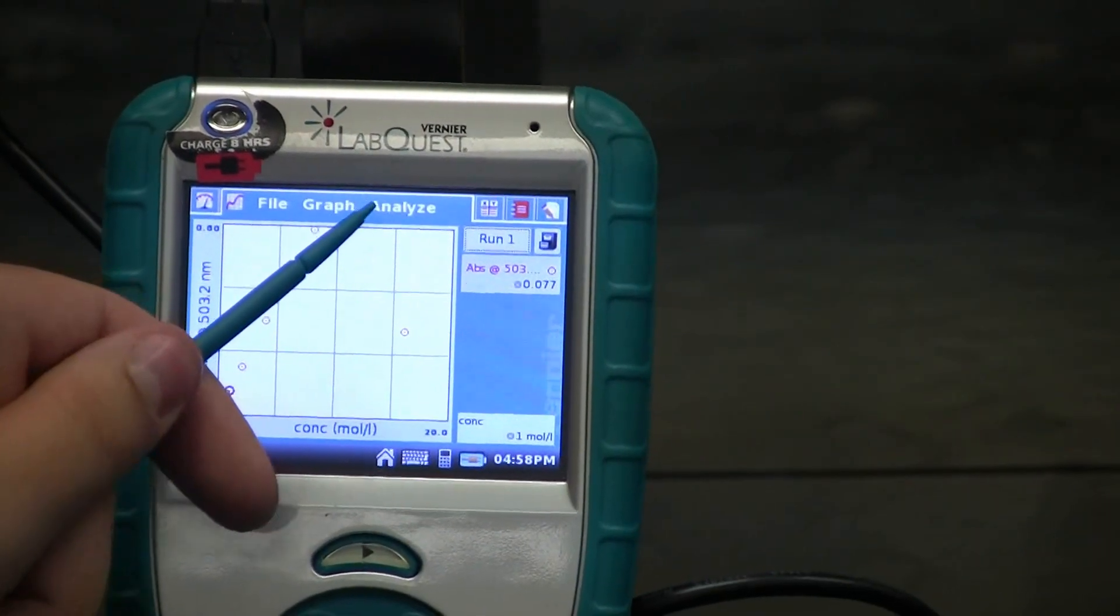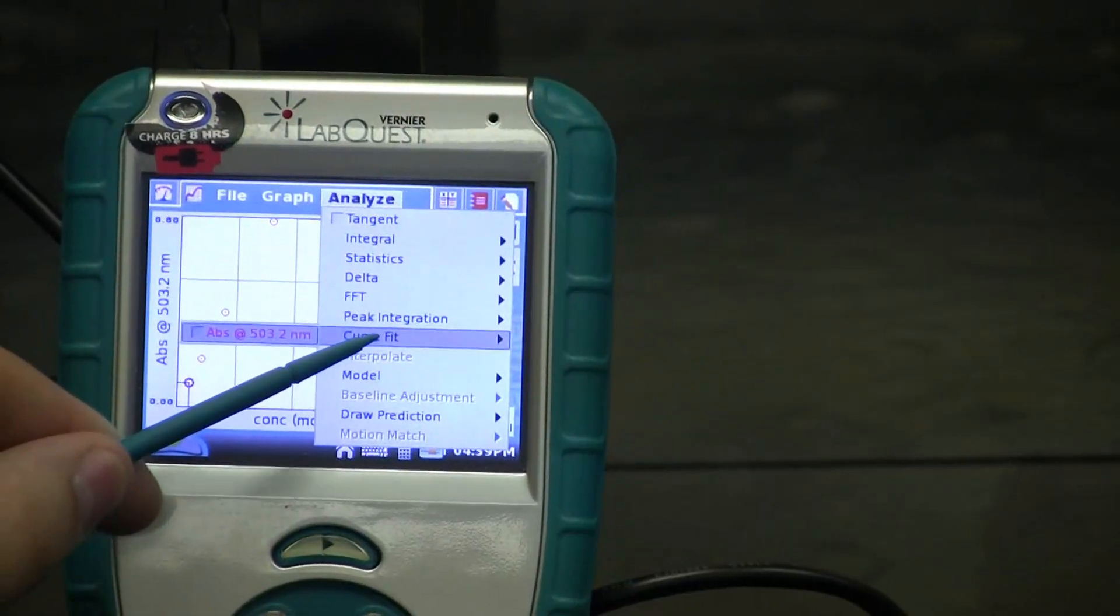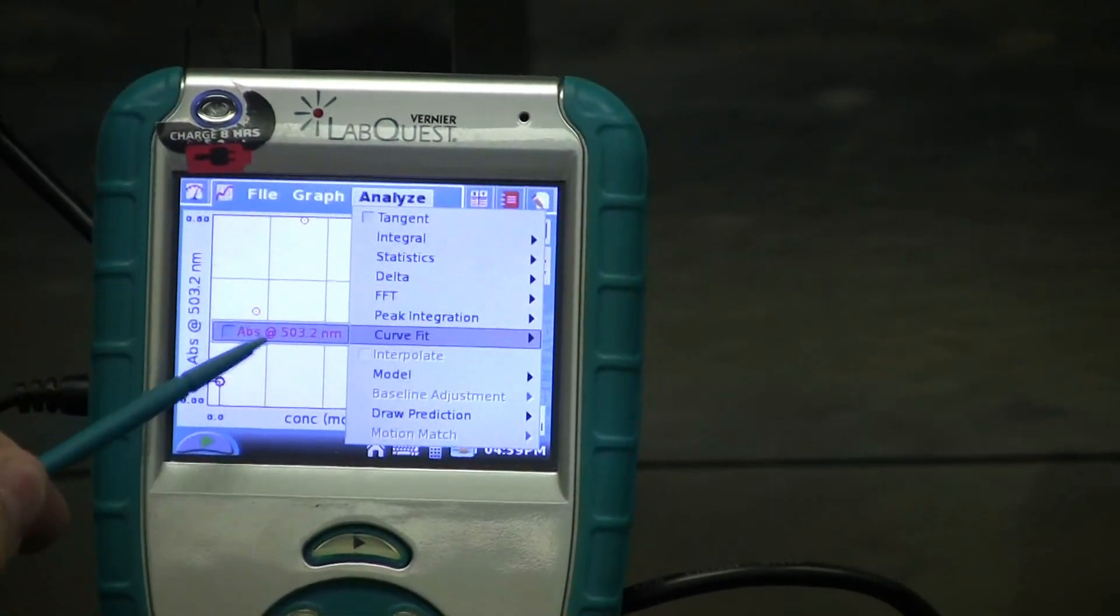To obtain a line of best fit, start by clicking on Analyze, and then Curve Fit, and the absorption next to this.